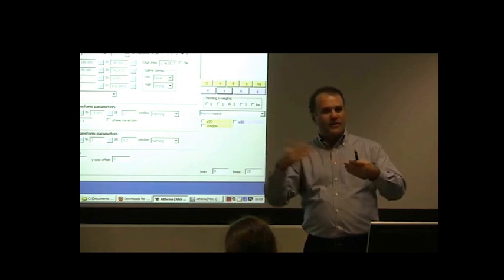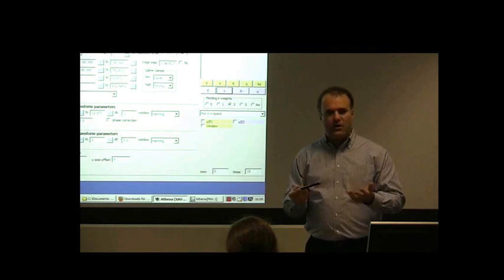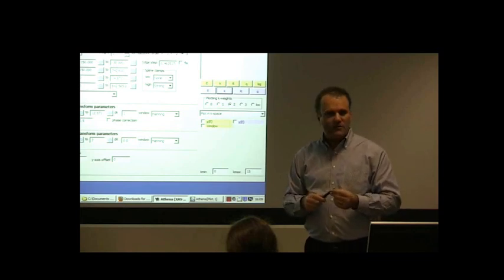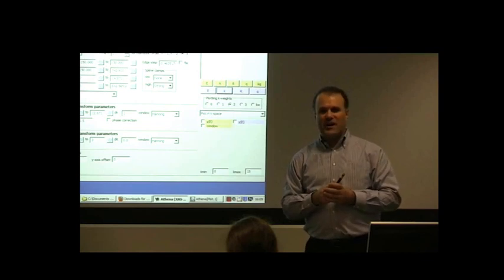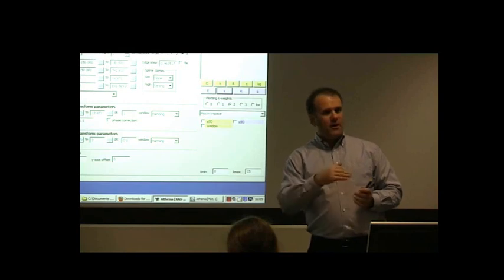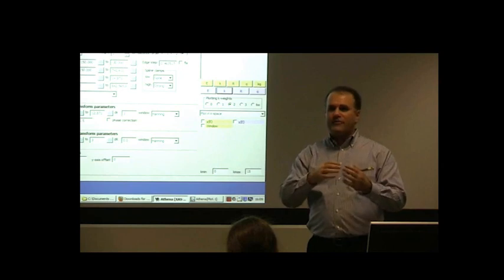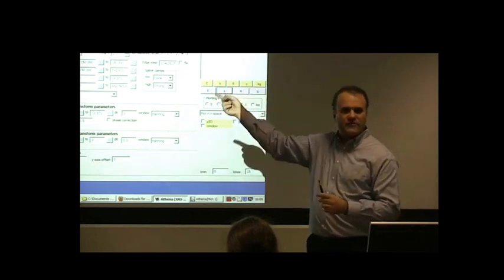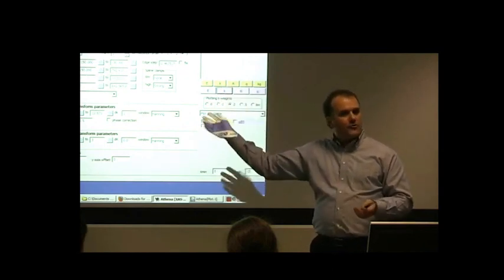At my beamline, I have this 25-year-old monochromator that is sort of a tired old man, and when we move to NSLS2, I think my old monochromator will be happy to go into retirement. But for the moment we're still using it hard, and we have the problem that when we go to the end of the scan and come back to the beginning, we might not be in quite the same place. There can be probably not a 4-volt shift like I just introduced artificially, but there might be a half a volt or a third of a volt or something like that.